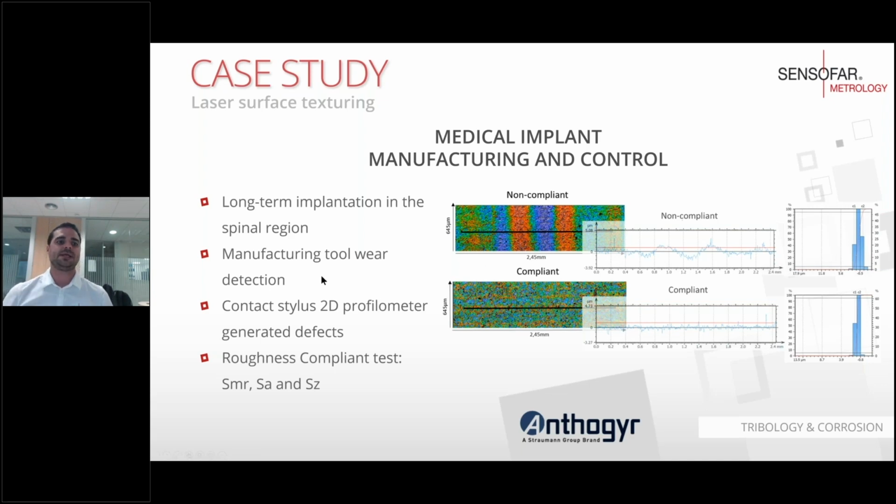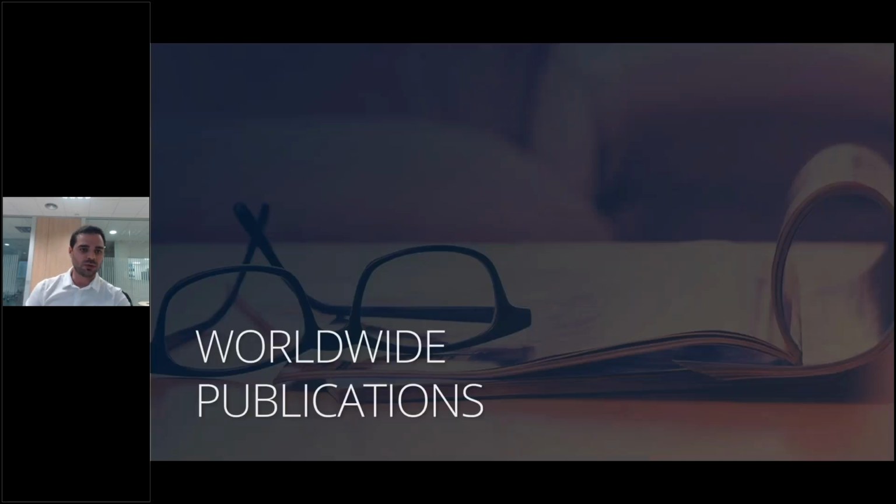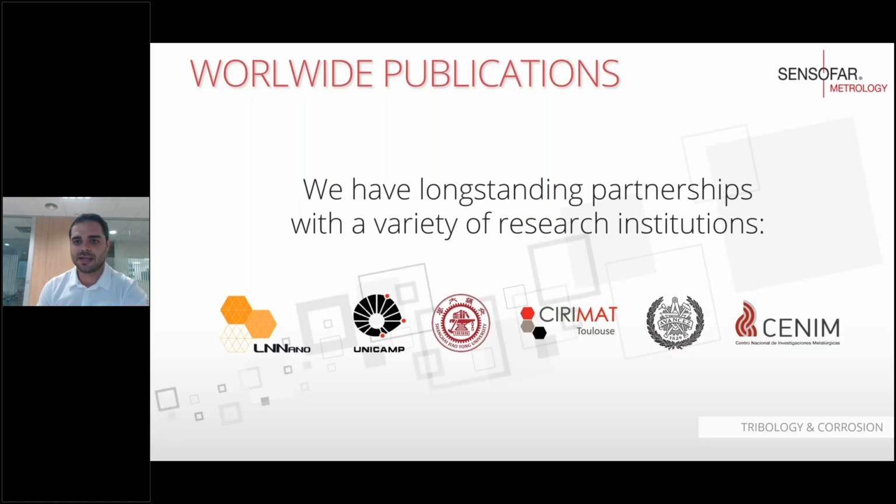So what happened? They needed specifically a non-contact profilometer, because if they were using a stylus, it was adding some defects after the analysis. Now, what we will do is to have a fast review of some worldwide publications. Here are the institutions that we will talk about.